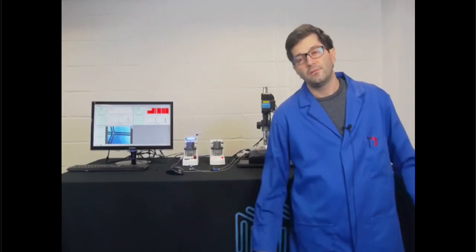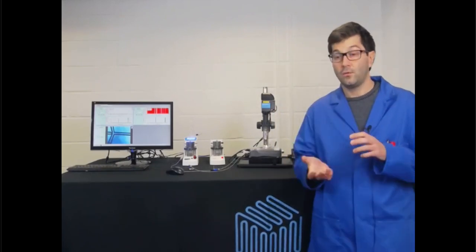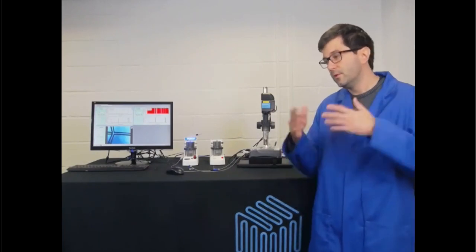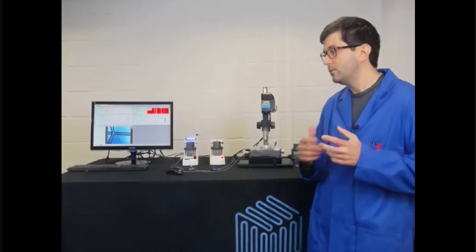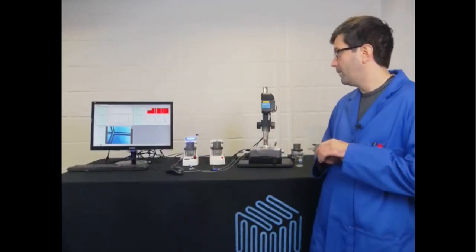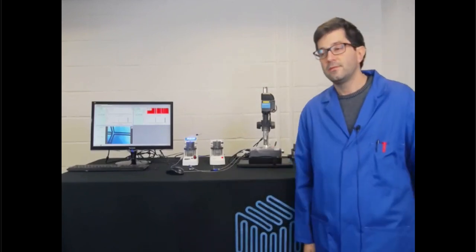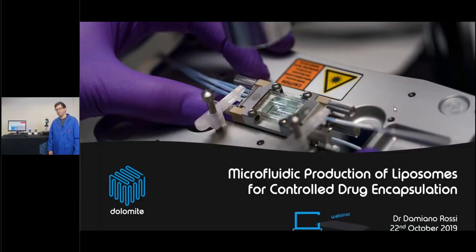The webinar is structured in three main parts. We're going to go through a brief presentation. Then we will move in front of the system, and I will describe the system, how it works, and how we can use the several components for the controllable production of particles. The last part will be a section dedicated to questions that you might have. At the end, I will be answering those questions. So let's move to the presentation.